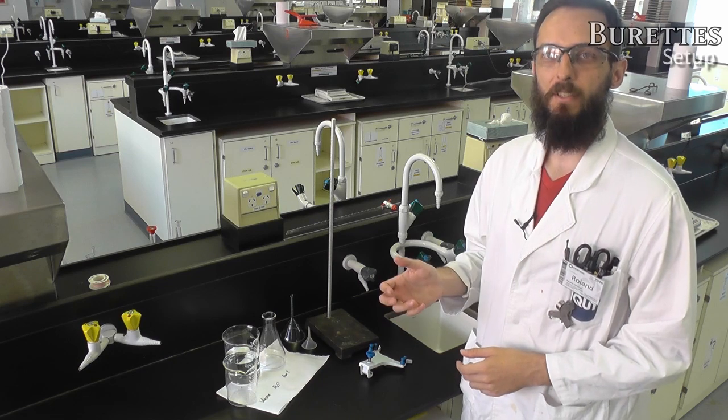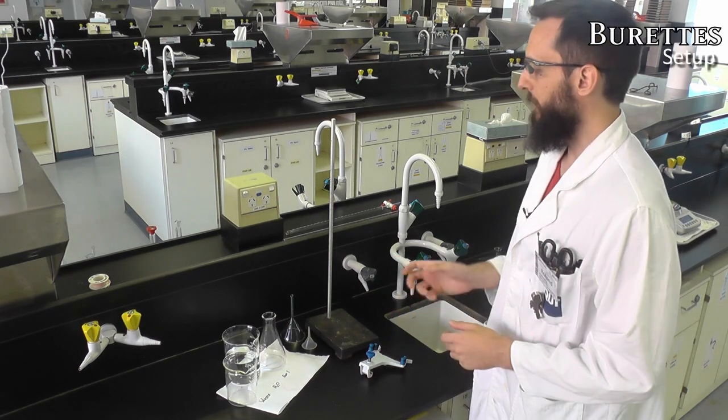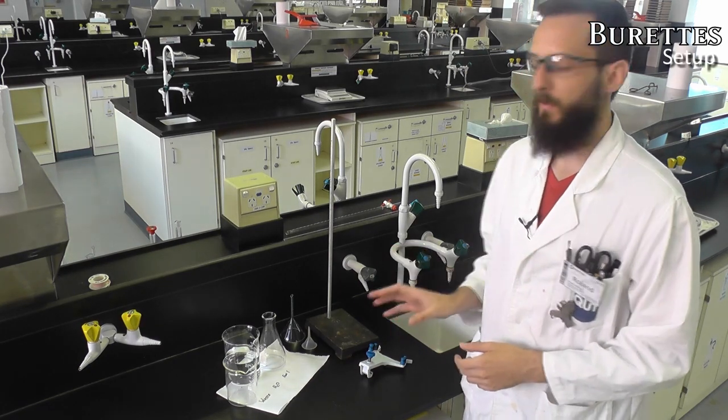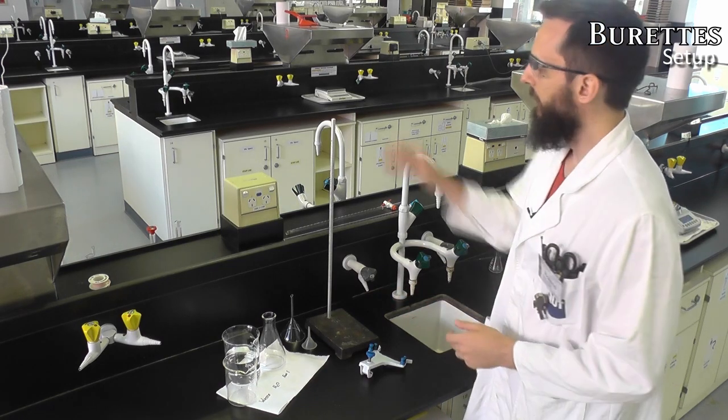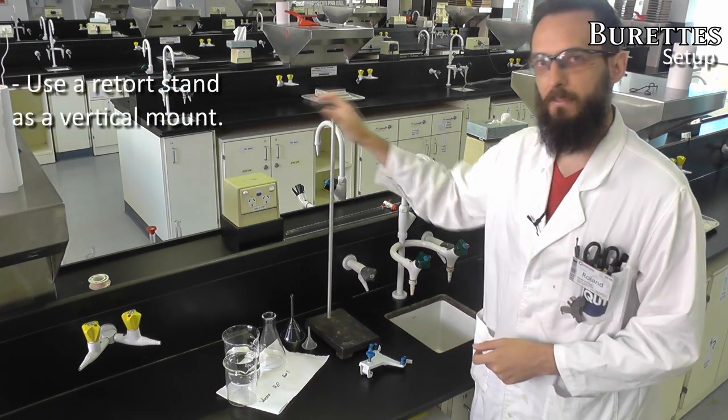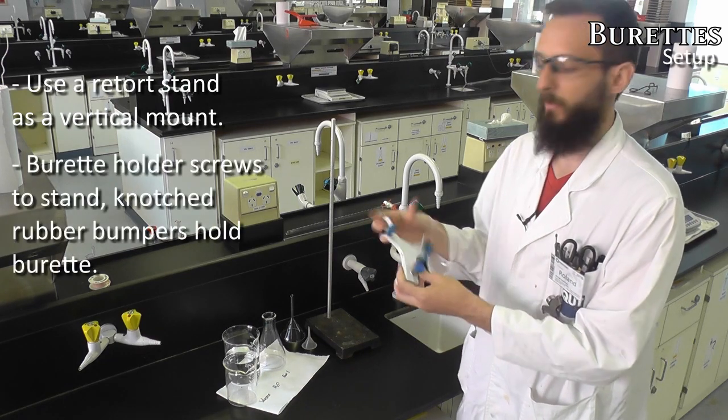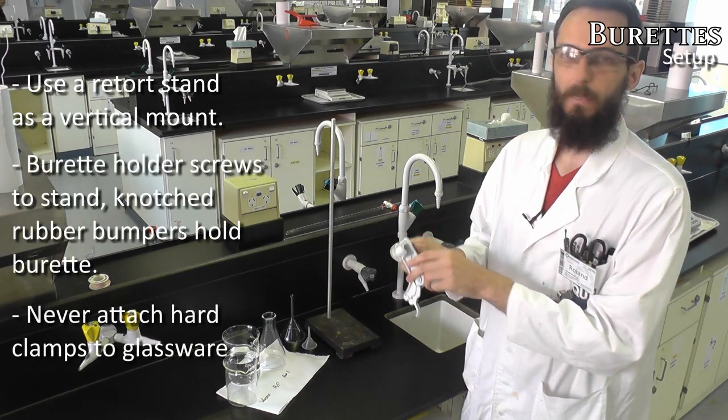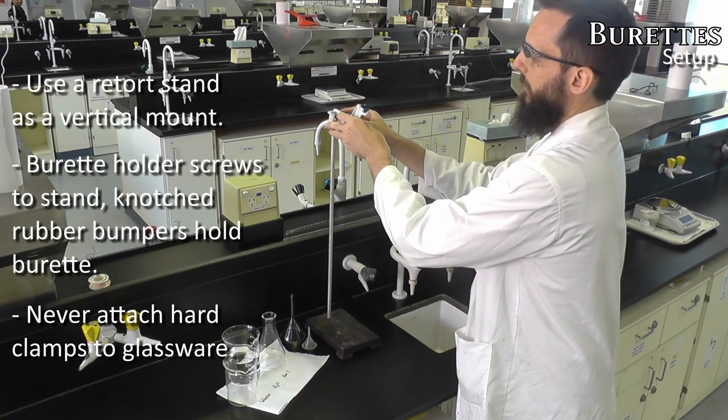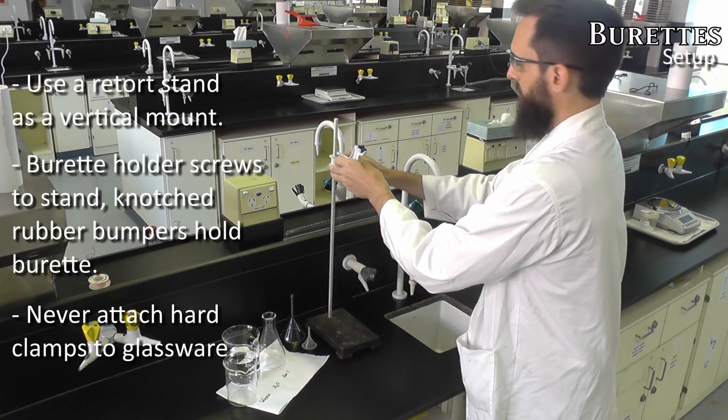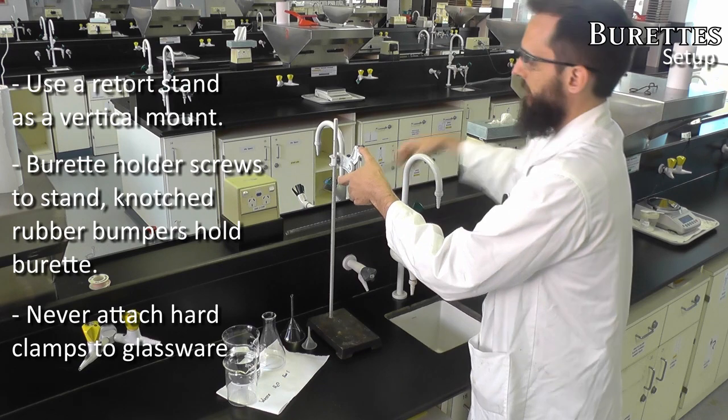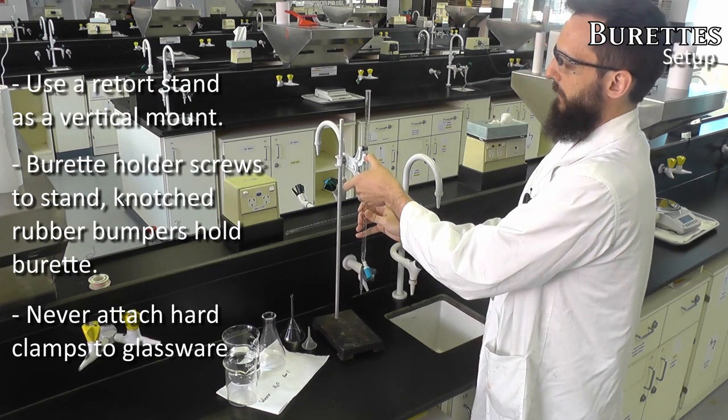Burettes are used to measure stepwise additions of volume. They're most commonly used in titrations, and before I jump into how to use one, first I want to show you the setup that you'll need. Here you have a retort stand and a burette clamp, so you'll see that one side has these rubber holders and the other has a screw. Make sure you always screw onto the metal rod of the retort stand, and then the burette itself clamps into these rubber holders.